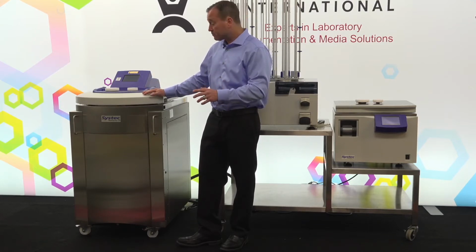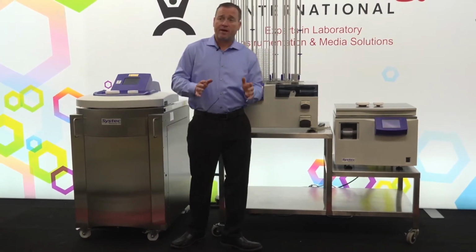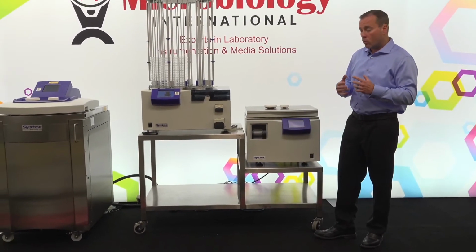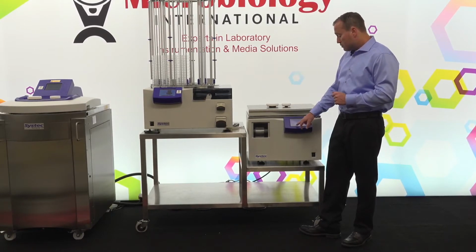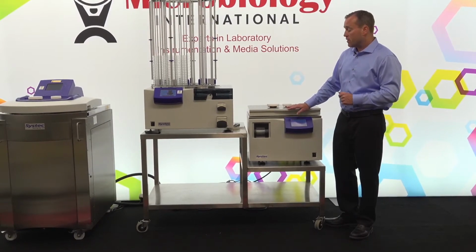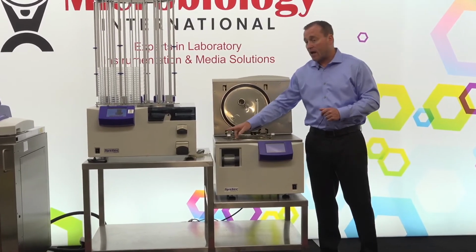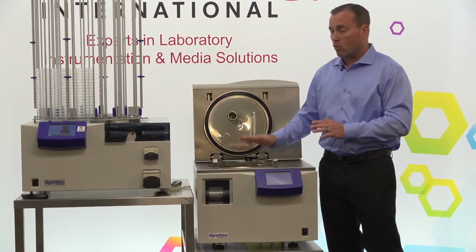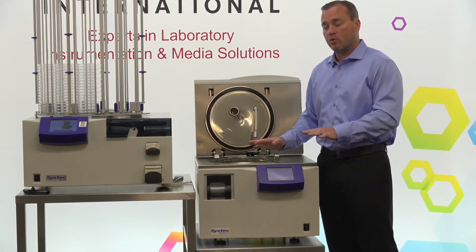And then the 45 and 65 are just a little bit thinner and are roughly the same height as the 90 and the 120. So what we'll do is go back to the MediaPrep 10 after that brief overview and look a little bit at how the system would work and the way that you would prep this in order to sterilize your media. I'm just going to hit the open key on the system, and then the lid will open for me. Once that lid is open, it is hinged quite easily. There are locking pins that go into the top of the system that allow us to close the lid. Once that senses that it's closed, the pins will lock into position and it will be sealed.